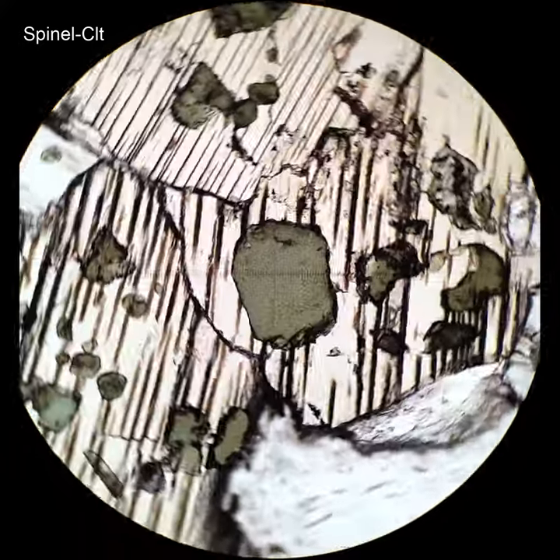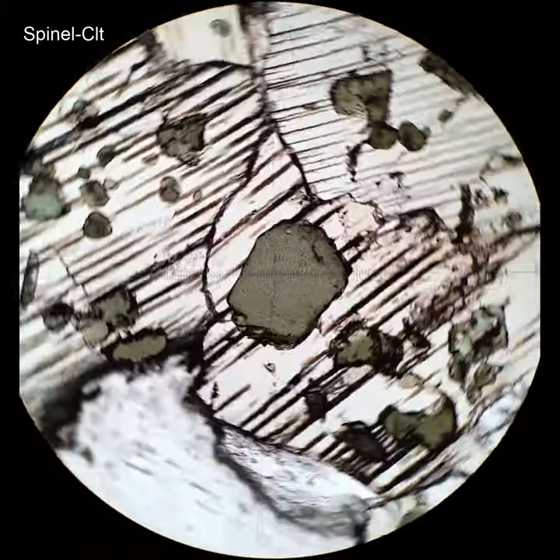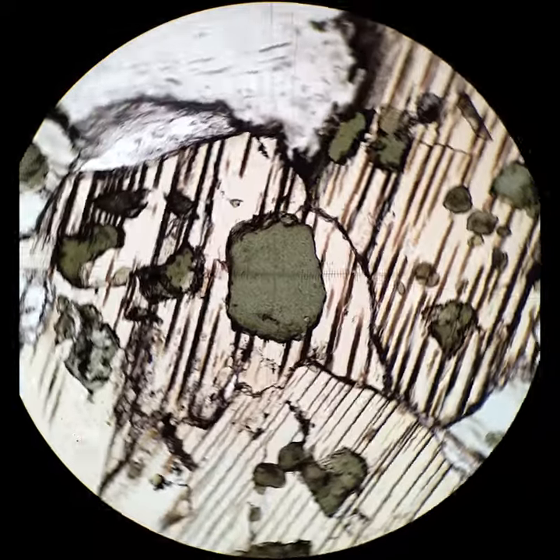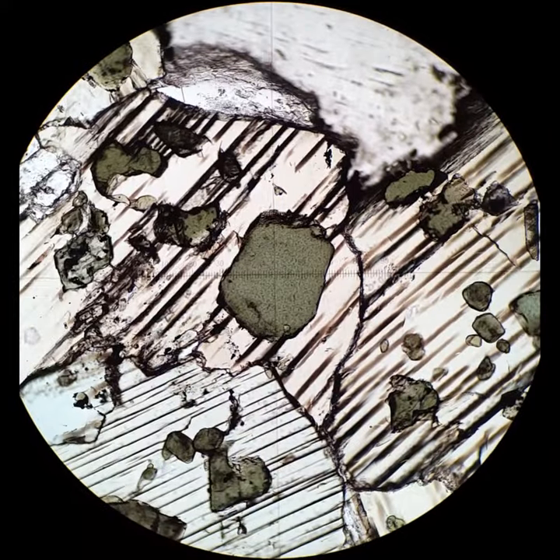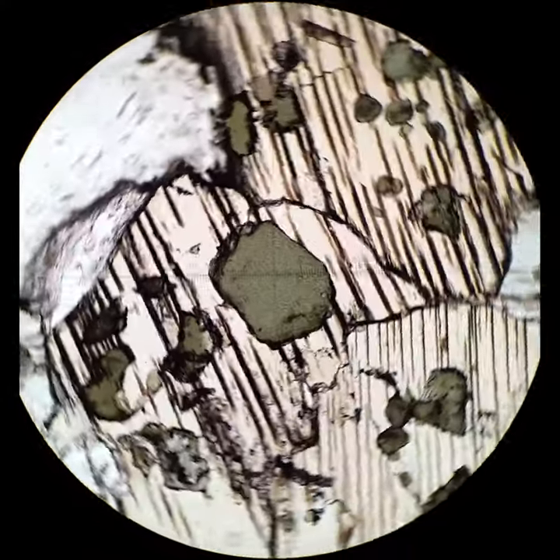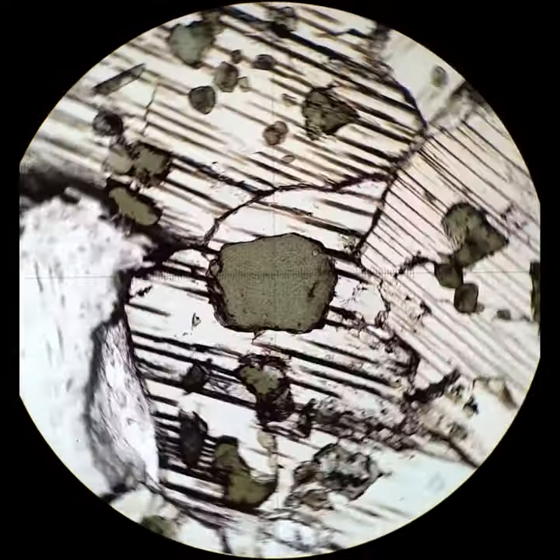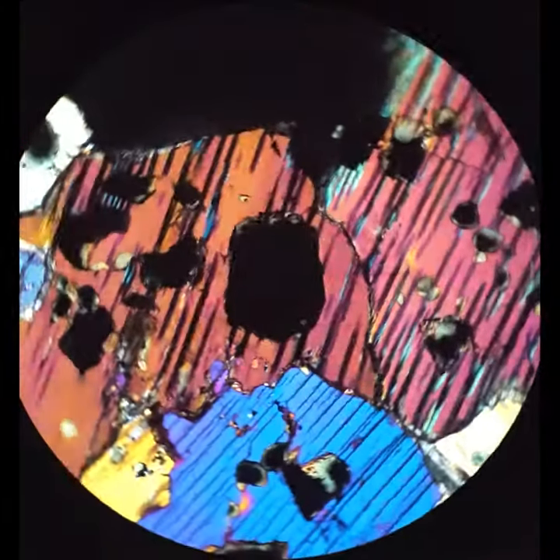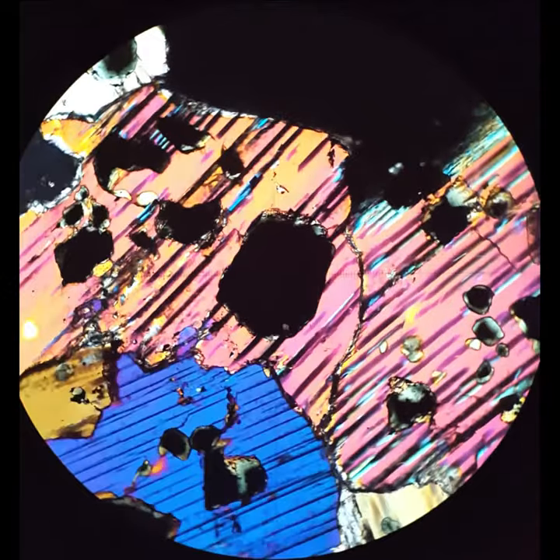What's distinctive about spinel is it's highly colored and it's isotropic. So when I cross the polars you'll see that it is black and just stays black. It has high relief and it occurs in certain special rock types. This one happens to be a calc silicate. It also occurs in ultramafic rocks and peridotites.